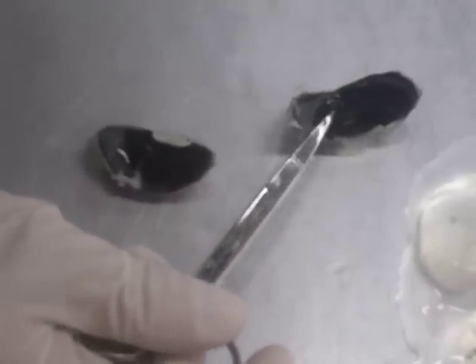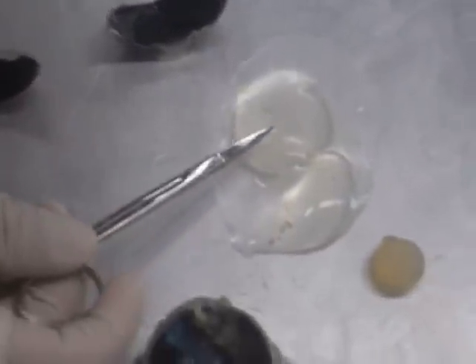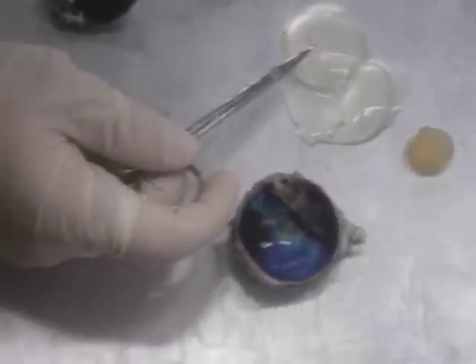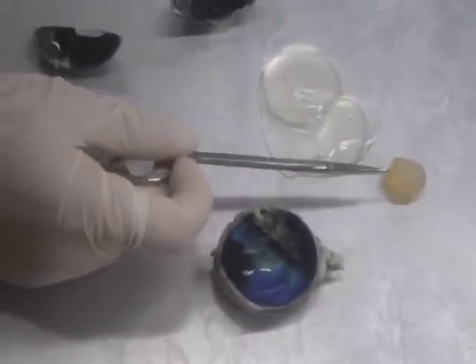After that, we're going to point out the vitreous humor, which is the gelatinous substance that came out of the center of the eyeball. And next, we have the lens.